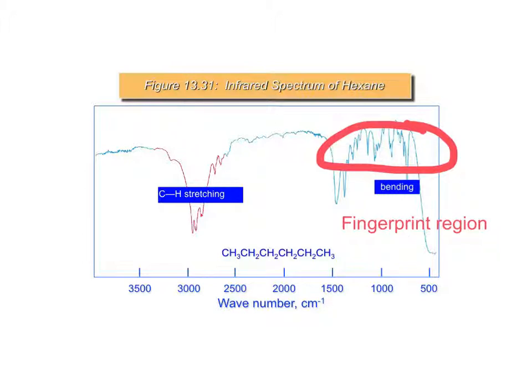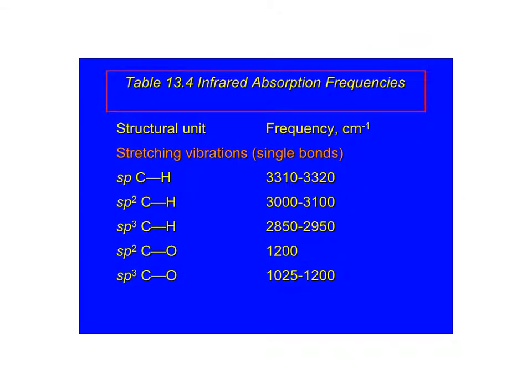If we looked at hexane versus hexene, which is coming up next, you should be able to see the difference between these two. If we look at where the stretching is occurring in the alkane, and the bending for that matter, it's near 3,000, but once again, don't memorize the numbers, please. Oh, whoops, I thought I had them back and forth, but I don't.